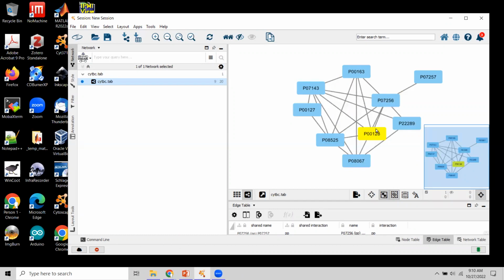So that's what's here. Now, interactions came from the PDB file. So this is a pre-made network that's based on one particular structure, but in principle, the proteins that you import can be coming from your experiments or from somewhere.